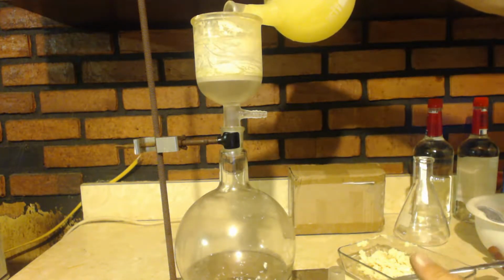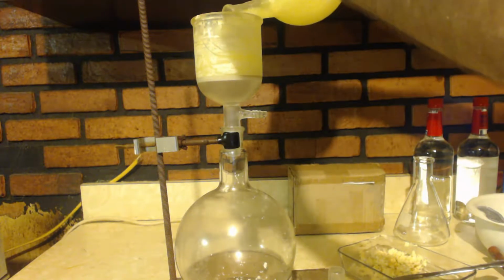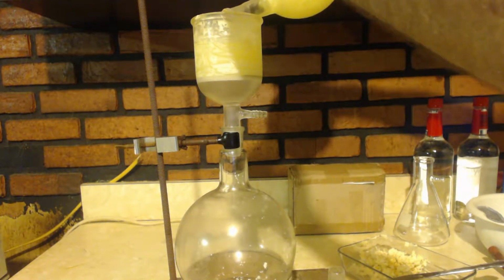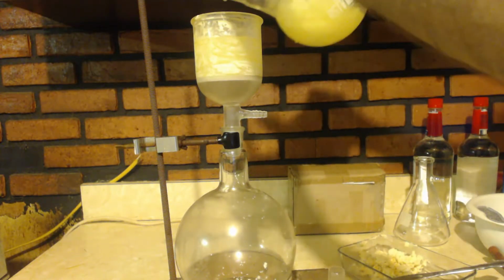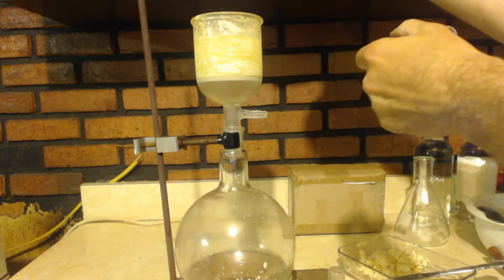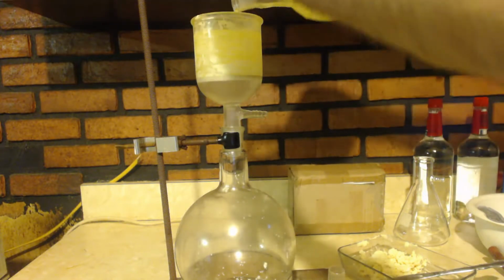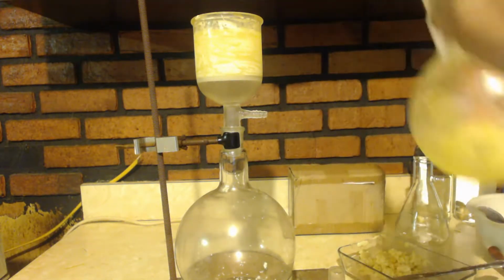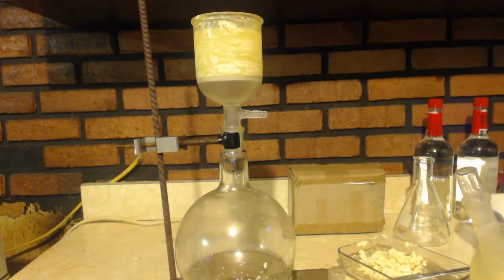There we go. Just needed to take a cap off. Looks like I let it freeze too much. So I'm just going to let that gravity drip.